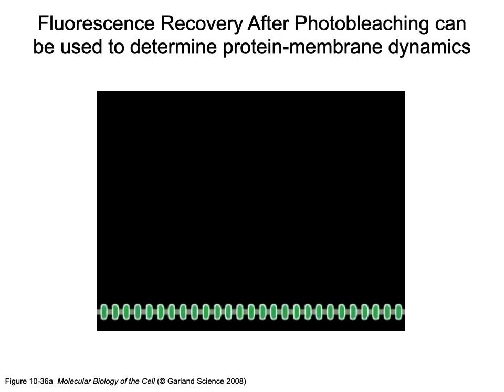This video shows the technique of FRAP and how it's done, so that video will be posted under the files for Unit 2. What you'll see in that video is that the laser is focused in an area, and it ends up deactivating those fluorescent proteins in that area. Then, depending upon the protein, if it's one that can move freely around in the plasma membrane, we would get redistribution, and so the light intensity would increase because we have this replenishment of active fluorescent proteins.